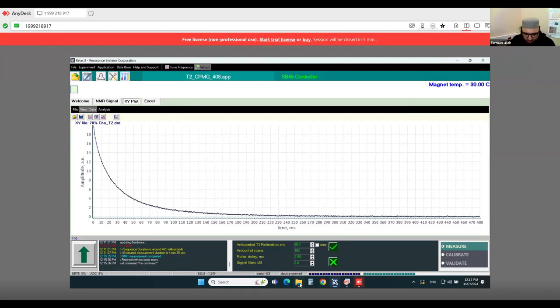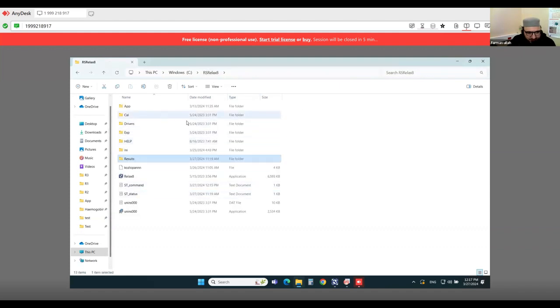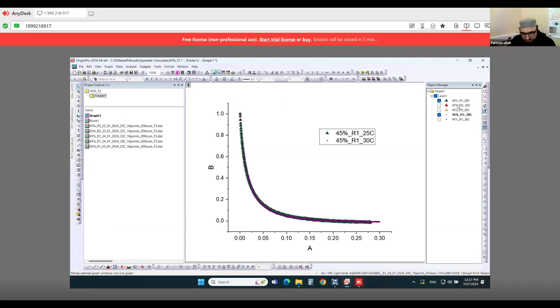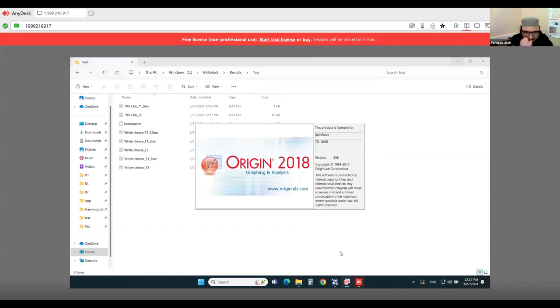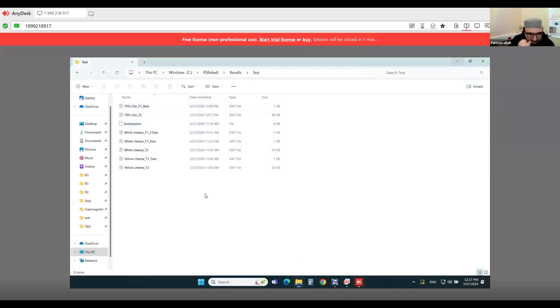So now I am going to show you the results we have. Okay, let me start. I have all these results.